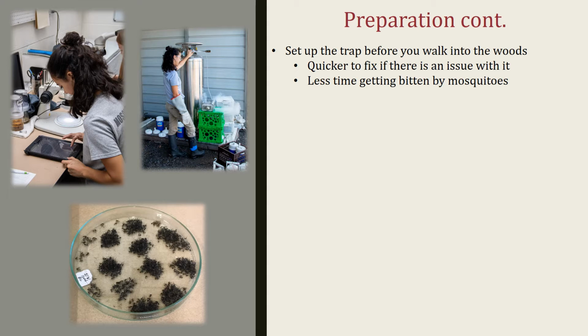Set up the trap before you walk into the woods, and this is usually on the tailgate of your truck. It's quicker to fix if there's an issue with it, and it's also less time getting bitten by mosquitoes.